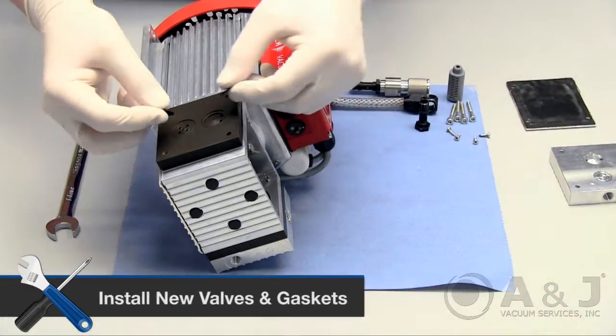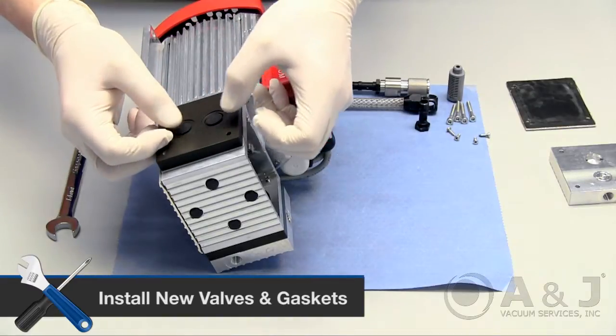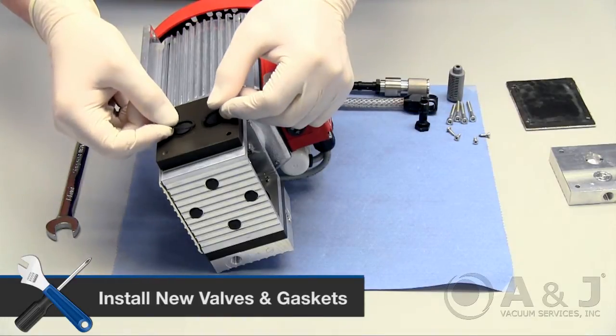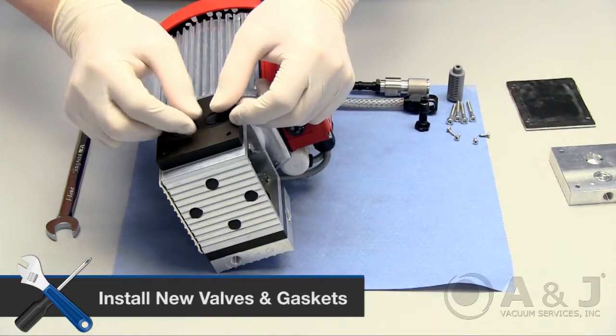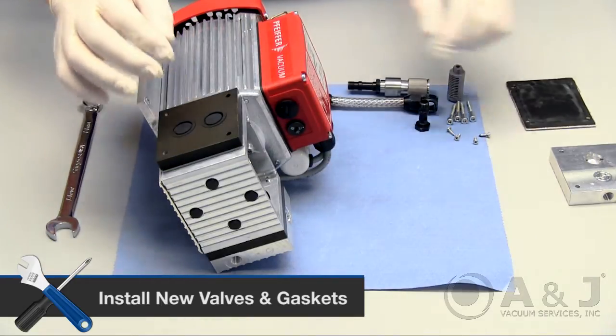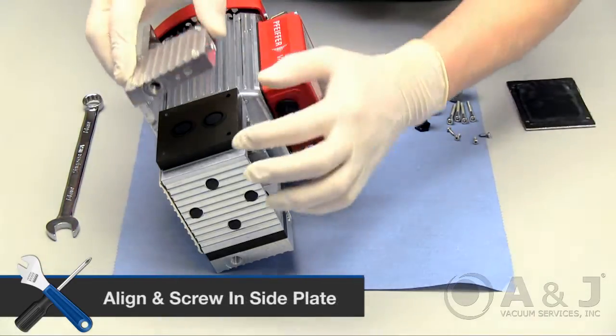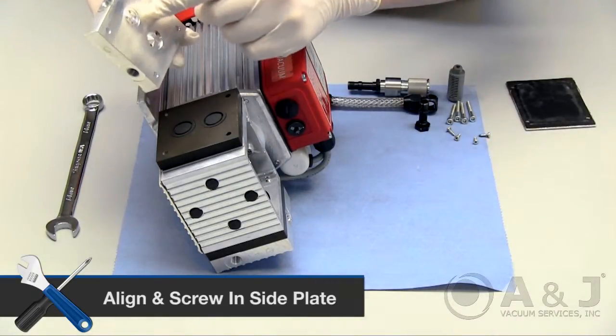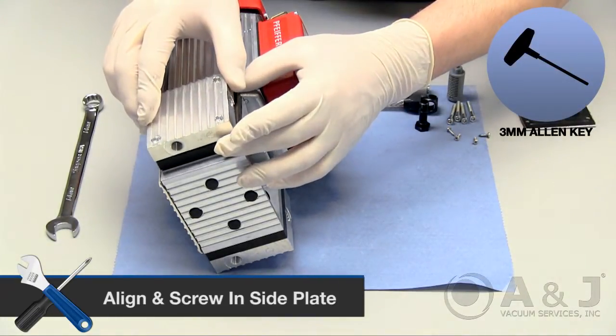Install the two new valves on top of the intermediate plate by placing them on top and pushing them into place. Align the side plate with its corresponding number to ensure proper alignment and orientation and screw back in with a 3mm Allen key.